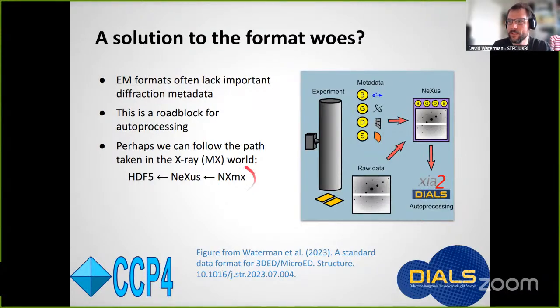And that is a particular flavor of the general NeXus standard. And NeXus files can be represented using standard HDF5 storage technology, so HDF5 files. There's also an NXem standard that contains additional information about electron microscopes, so it'd be possible to bring in other information about the experiment and record it in the same file.